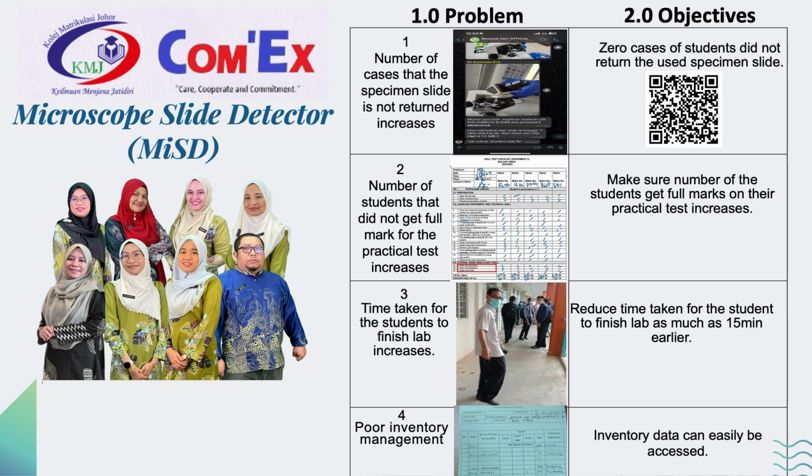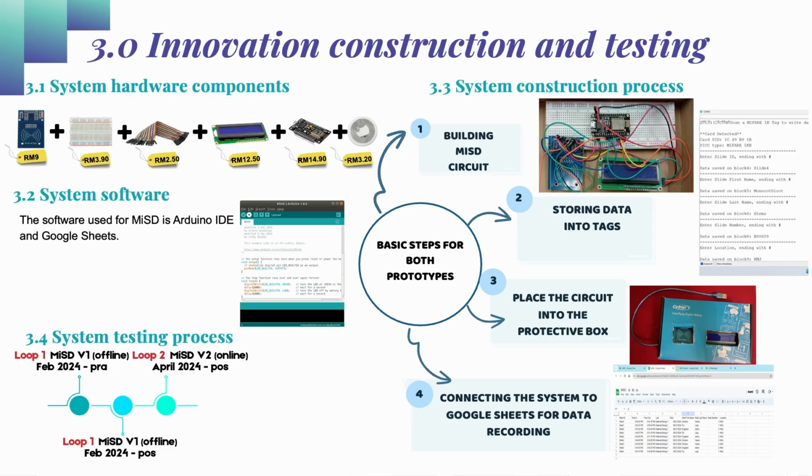0 cases of students not returning the used specimen slides, make sure that 100% of the students get full marks on their item storing in the practical session, reduce the time taken to finish the lab by up to 15 minutes so that students will have more time to manage their belongings, and manage effective data storing with easy access to all the inventory data. So here are the innovation, construction and testing.